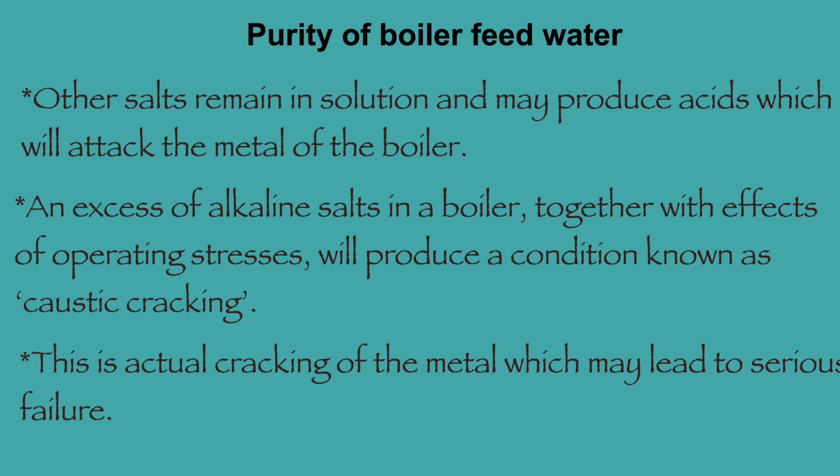Other salts remain in solution and may produce acids which will attack the metal of the boiler. An excess of alkaline salts in a boiler, together with the effects of operating stress, will produce a condition known as caustic cracking. This is actual cracking of the metal which may lead to serious failure.